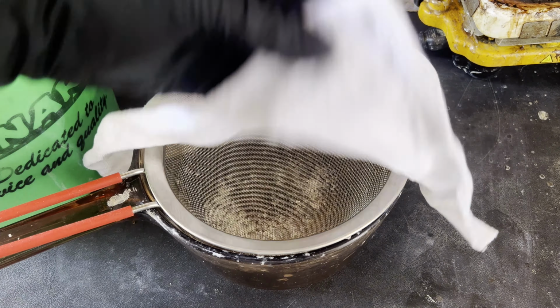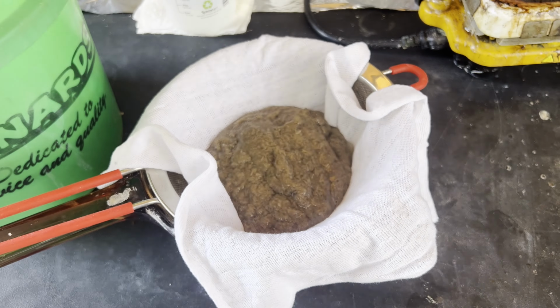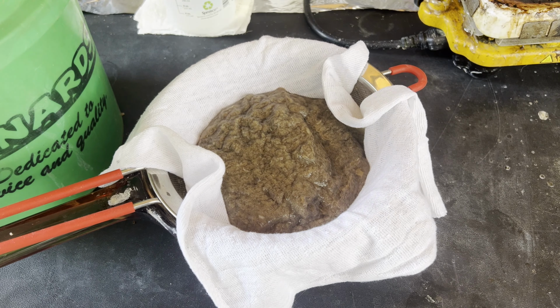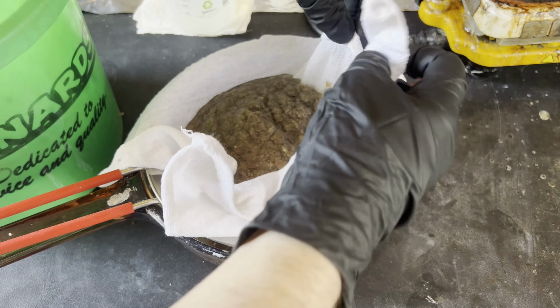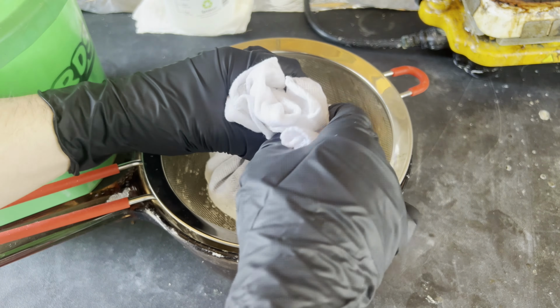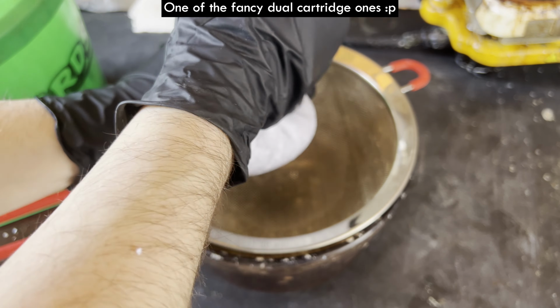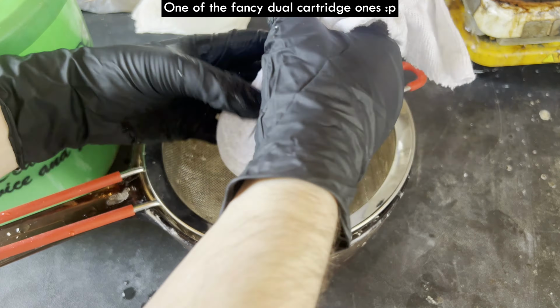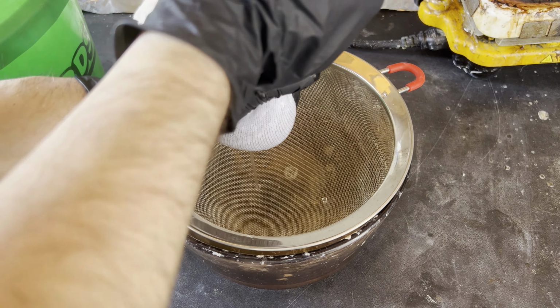Generally speaking, I'm not super concerned with every single recommended safety precaution and PPE for a lot of the chemistry I do. I wear gloves most of the time, but otherwise there's just not that much I do. This, though, I don't fuck around with, and I'm wearing a respirator behind the camera when I work with asbestos like this. It'll become especially obvious why I wear one later in the video.